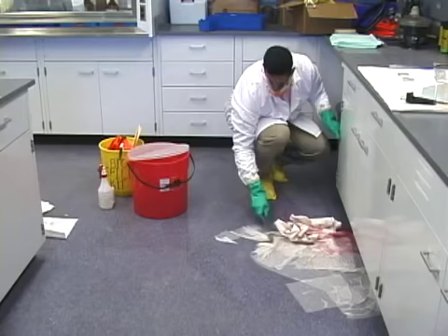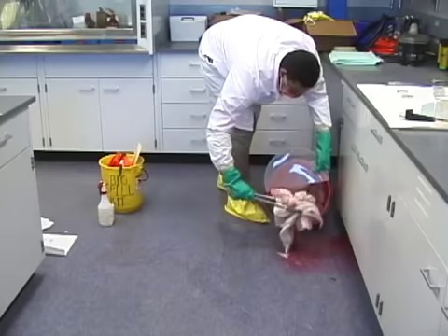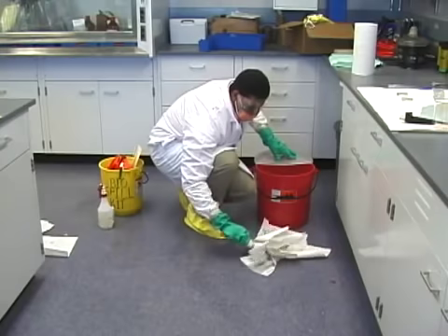After 15 minutes, gather and dispose of the disinfectant-soaked absorbent material in a biomedical waste bag or sharps container. Absorb any residual disinfectant with paper towels and dispose of them after wiping the area to remove any visible contamination.